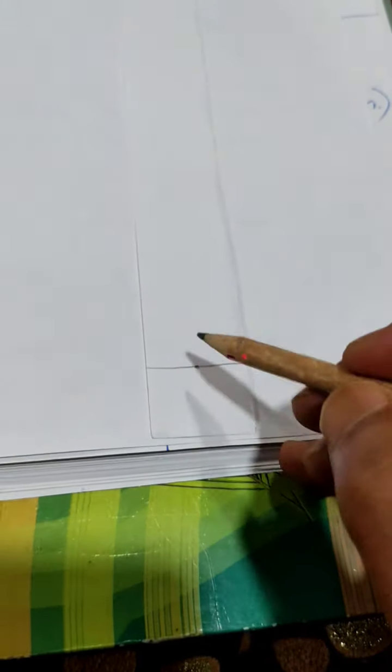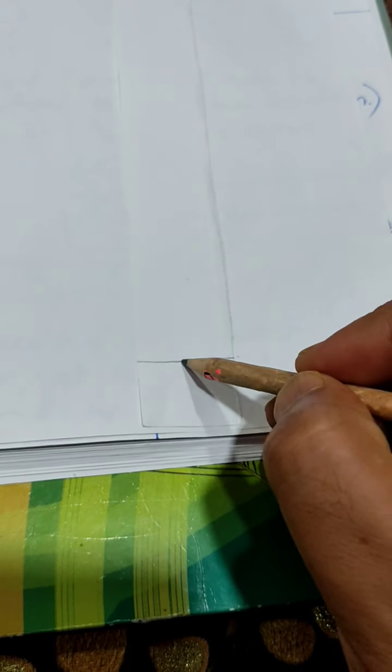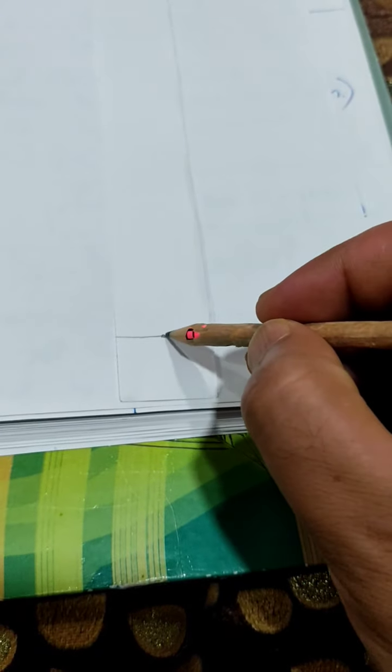I mean the mixture that you want to identify by separating the ingredients through chromatography. So this is the particular point, the midpoint of this line, at which you lay the spot. By using a needle or a capillary tube, you can spot it here.